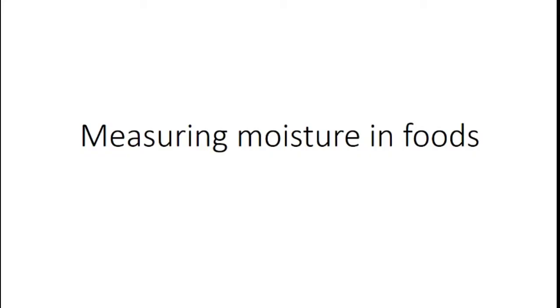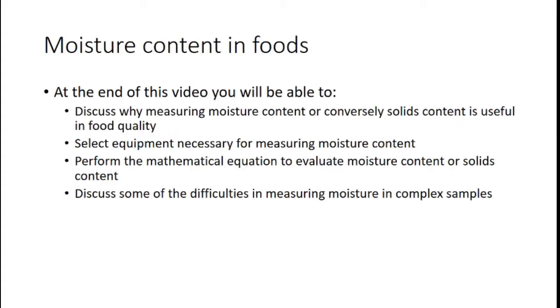Everyone. Today we're going to talk about measuring moisture in foods, and there's a lot of importance behind measuring moisture content in foods. In many cases it's a regulatory requirement to be able to indicate how much moisture, or conversely how much solids content, is in a food product for sale. You can't just pump food full of water and sell it, because that's not giving good value to a consumer. And so in many cases, governments have set these standards.